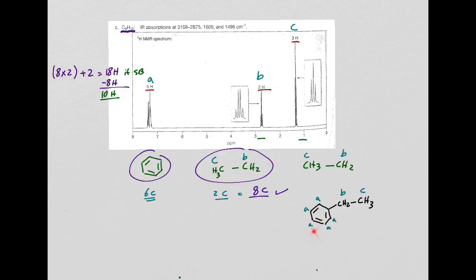I feel pretty good. 5 hydrogen over here at 7 ppm. This is CH2 directly attached to a benzene ring. That's why it's kind of downfield. We've been seeing that over and over again. When you're directly attached to a benzene ring, you become a little bit more downfield. I have that. On this side, it has no hydrogen. On the other side, it has 3 plus 1, quartet. I have a quartet. I come over here, it has nothing on this side, of course. It has a CH2 here, 2 plus 1, triplet. I have a triplet. Then I feel pretty good about this one.